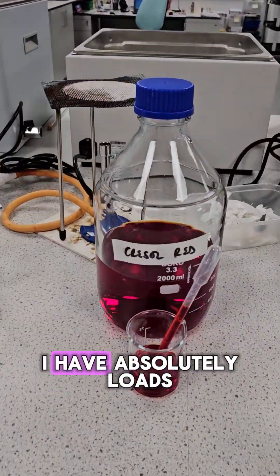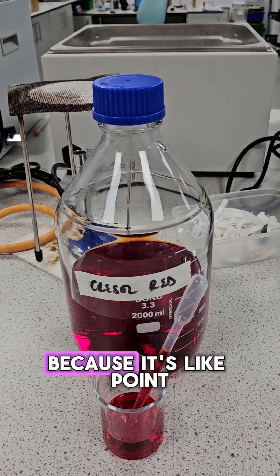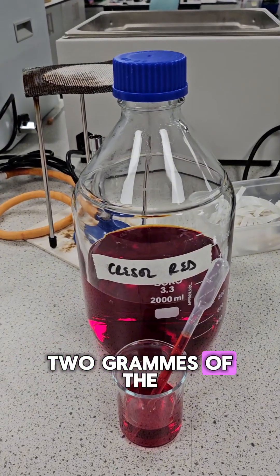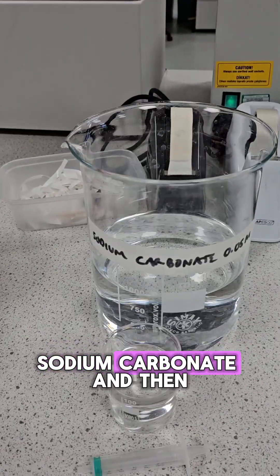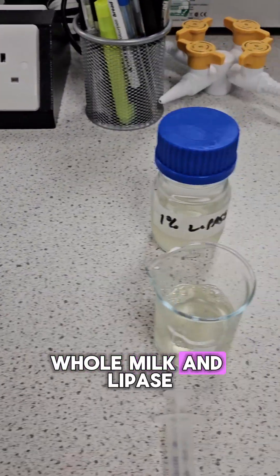And then round here I have absolutely loads — a litre of cresol red. You can't make any less than that because it's like 0.2 grams of the actual powder. Sodium carbonate. And then we've got milk, whole milk, and lipase.